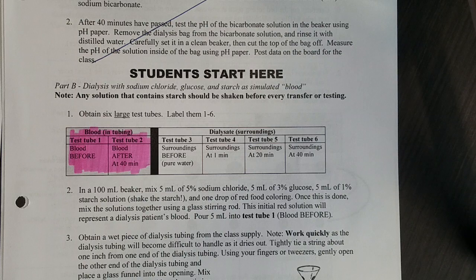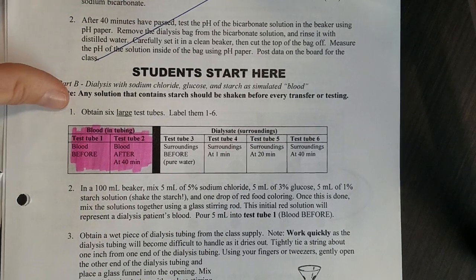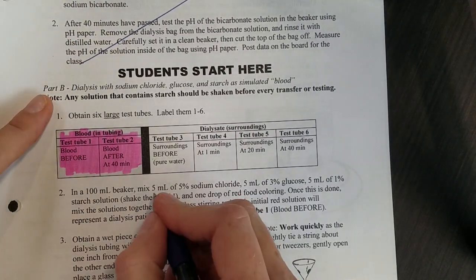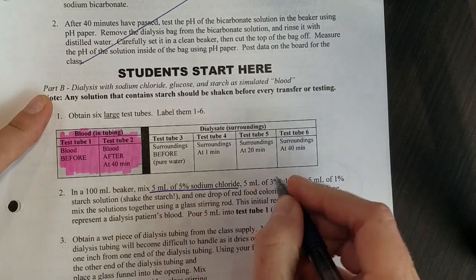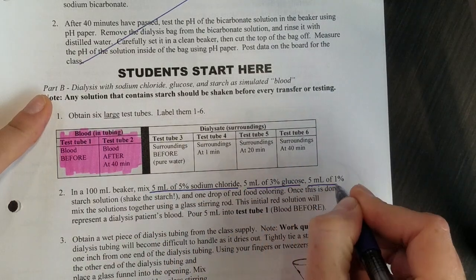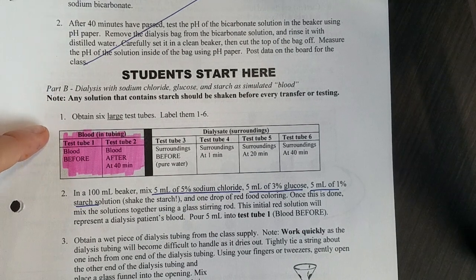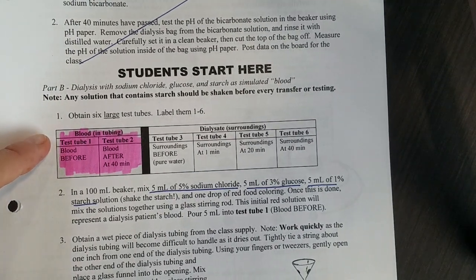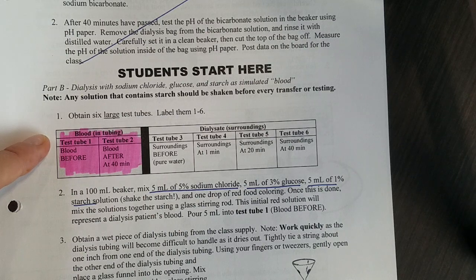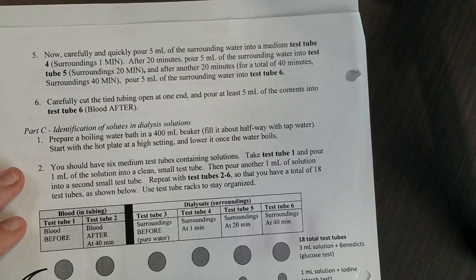You will see in the video that we mixed together three things: five mils of sodium chloride, five mils of glucose, and five mils of starch. That's what's going to go into the blood. Then you will put that into that tubing that has the small holes in it, the semi-permeable membrane.